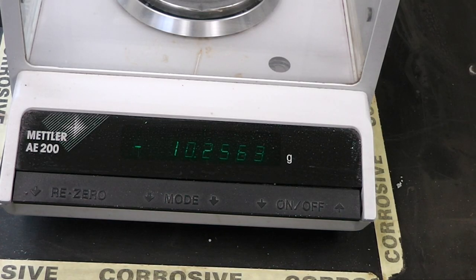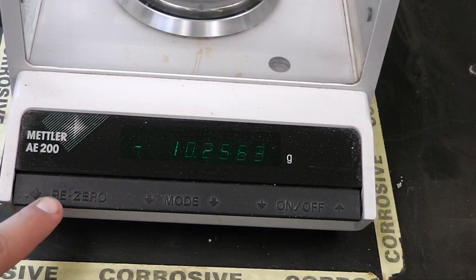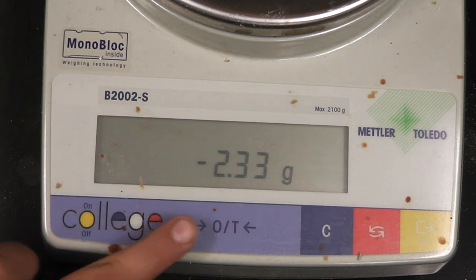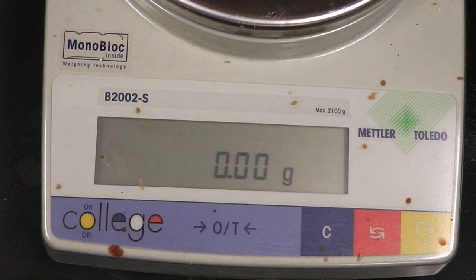To operate the analytical balance, simply make sure that the doors on the side are shut, there is nothing on the balance, and hit the re-zero button as you see there — that will set it to zero. On the top loading balance, it is simply the zero slash T button.